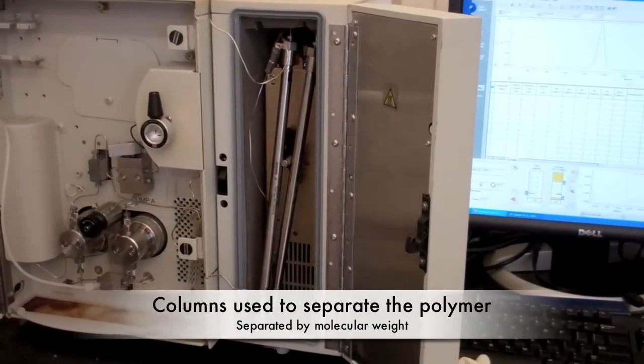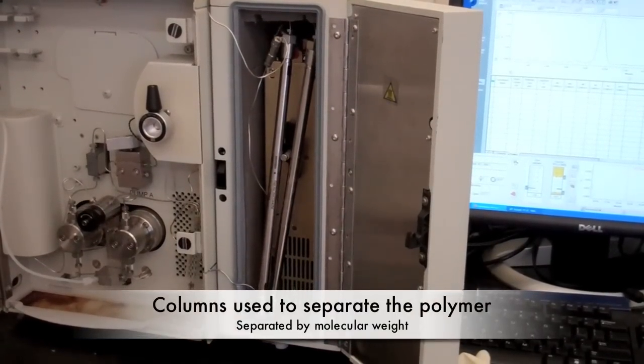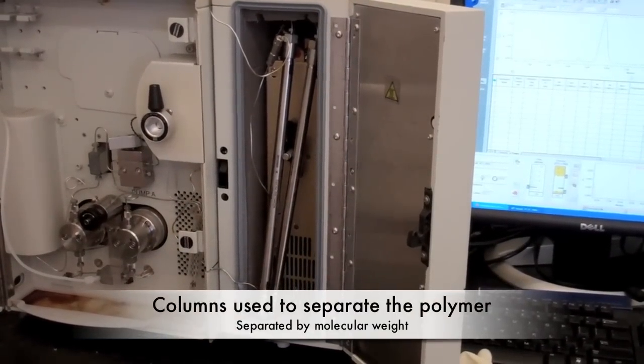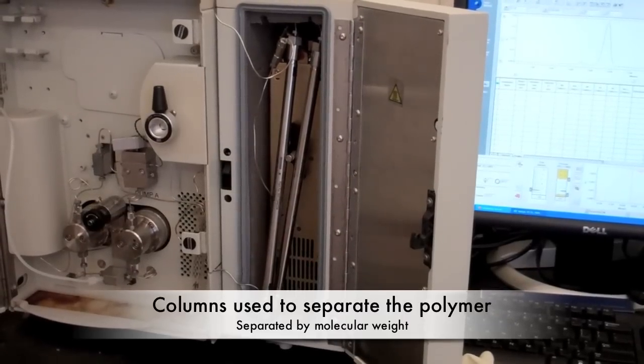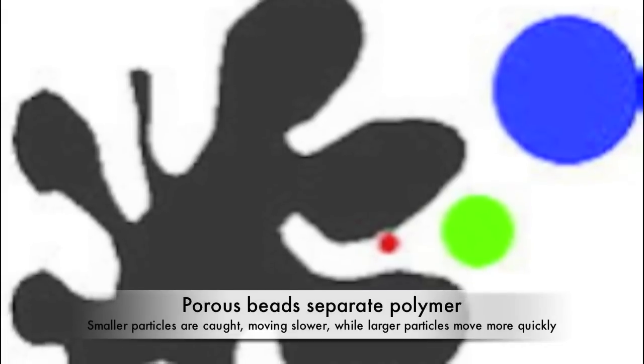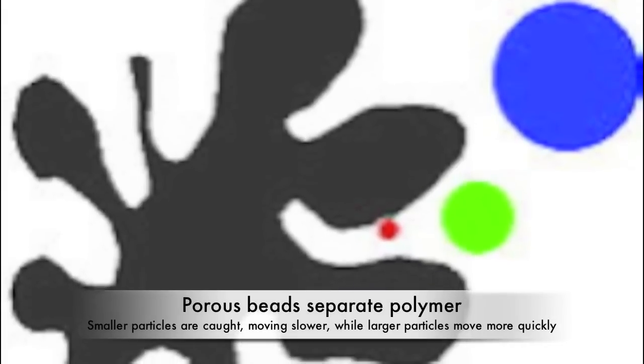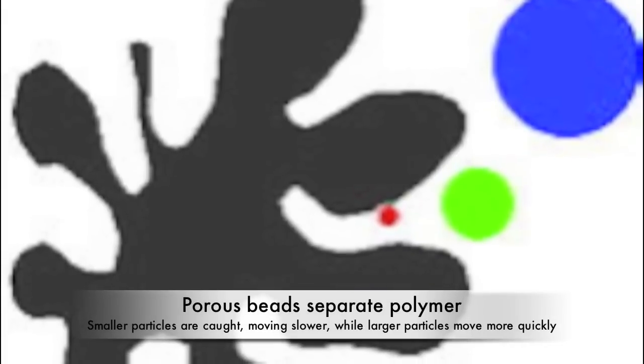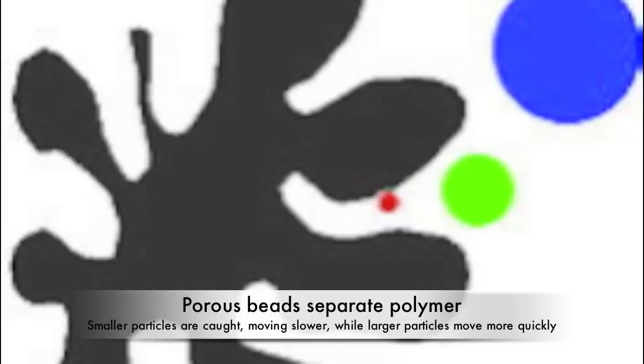The second component, the columns, is used to separate the polymers depending on their molecular weight as they are pushed through the instrument. Porous beads, typically either polystyrene or glass, are usually used to separate the polymers within the columns, causing larger polymer molecules to flow through quicker. Smaller polymer molecules are caught up in the beads and diffuse more slowly.